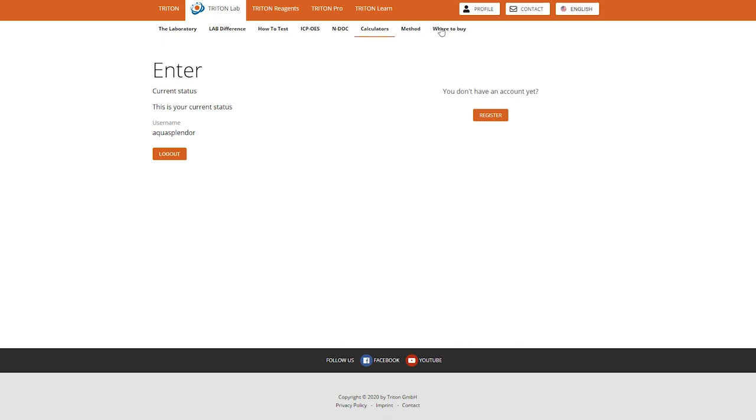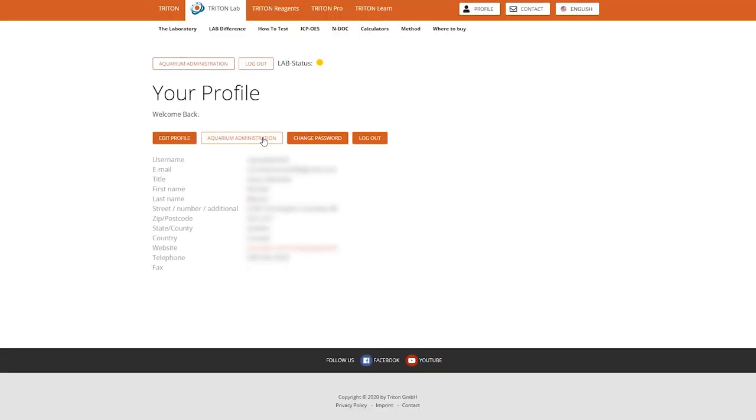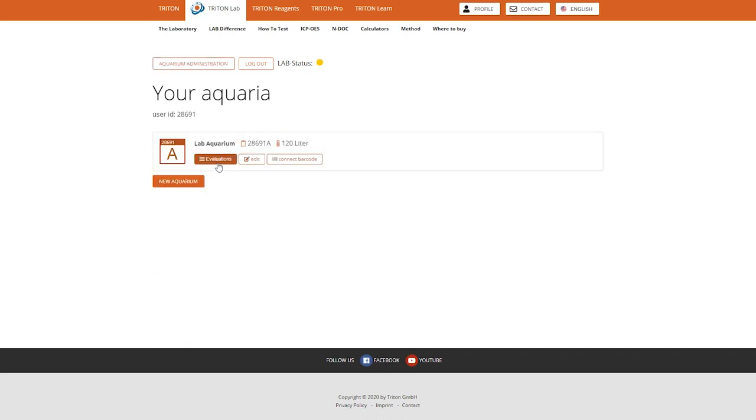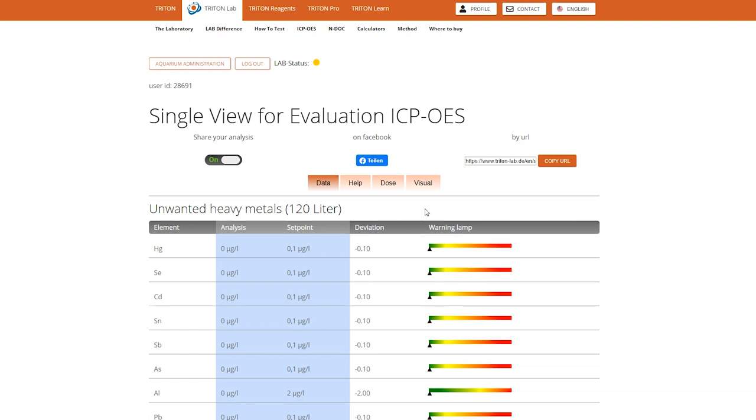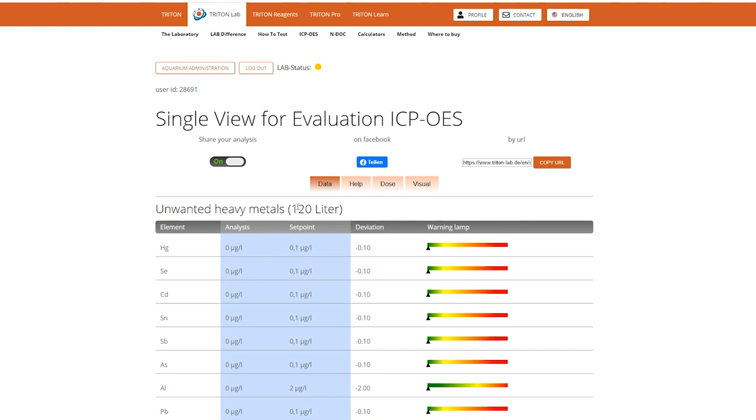And I go after that in the profile under Aquarium Administration. I click on Evaluation, and you can see there the barcode that I've used. You click on that, and here it is. So this is the page where you can see all the data from my aquarium. And the reason why I did this ICP test is because I had trouble with one of my salts from Red Sea, it's a Coral Pro. I had a crash with them, and you can see the video just up there somewhere.